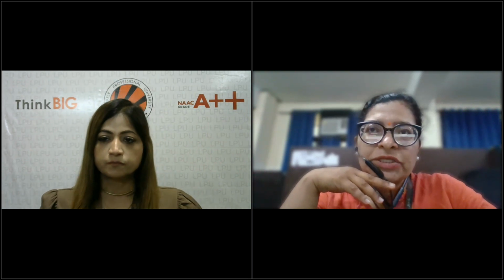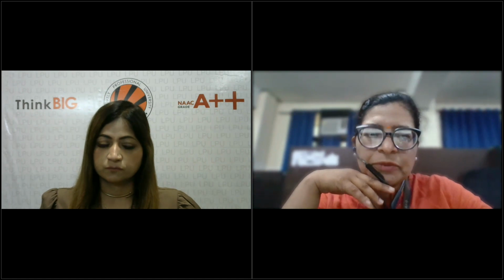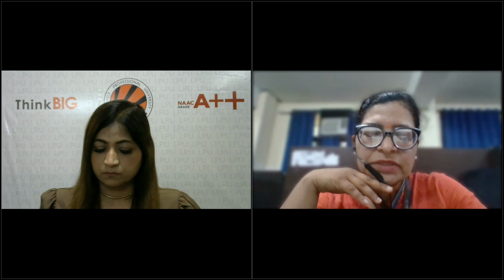Thank you for your question, and I hope you were listening to the PPT. It has a lot of applications in agriculture. You can check the quality of your plant if you are working on the production of some plants. So you can check whether your plant is ready to harvest.